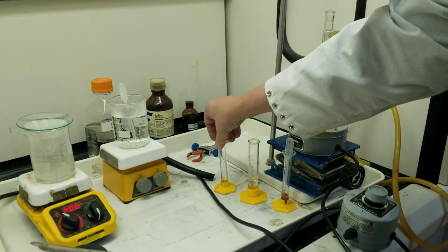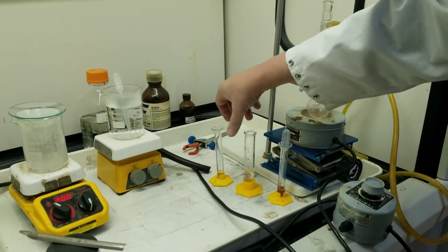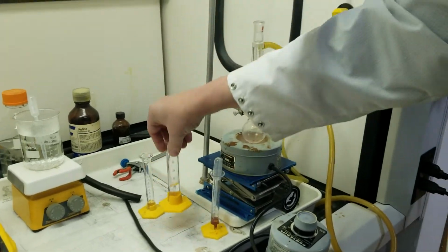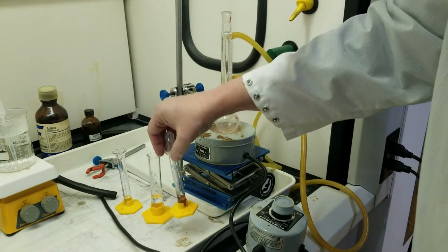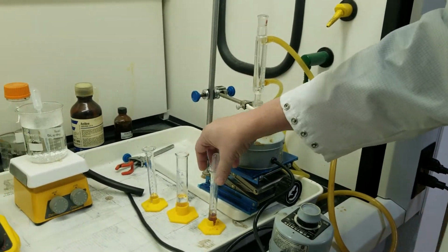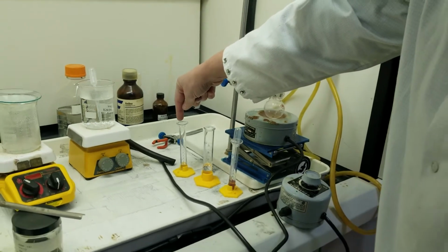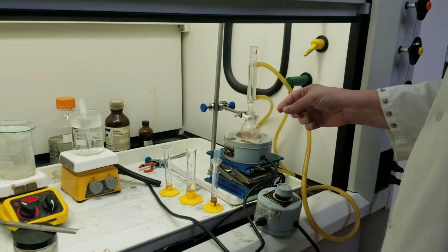I pre-measured the quantities we need. This is 2 milliliters of acetic anhydride, 10 milliliters of glacial acetic acid, and approximately 2.2 milliliters of the aniline. The two organic reagents are the acetic anhydride and the aniline. Those are the two we're going to weigh.